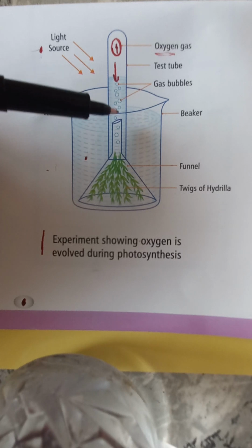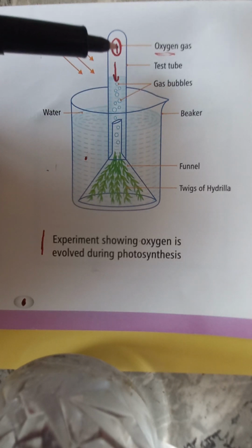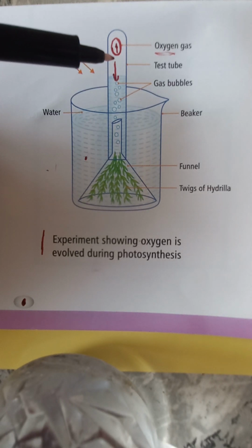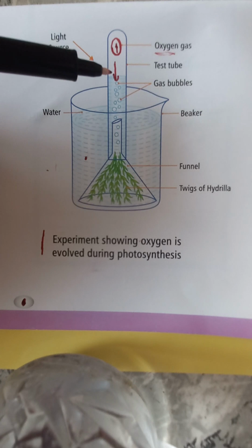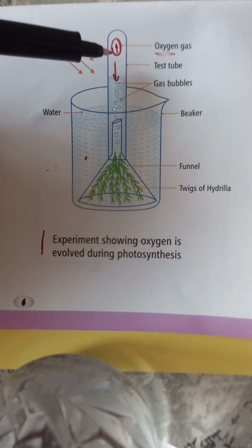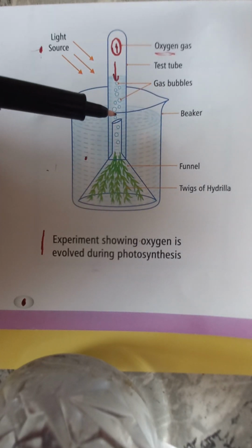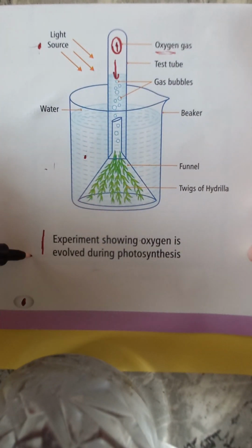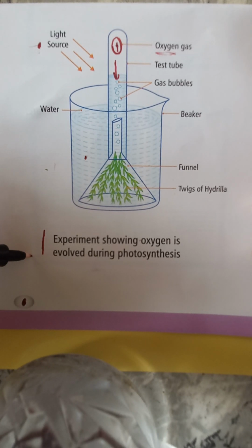Next step is that we are going to take off this test tube from here and bring a burning splinter near the mouth of the test tube. What we will notice, that the splinter is glowing brightly, showing that this is the oxygen gas that has been evolved during the process of photosynthesis. So students, this is the aim of the experiment, that is showing oxygen is evolved during photosynthesis.